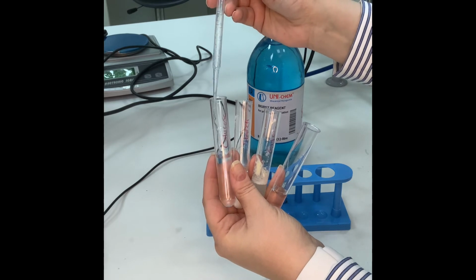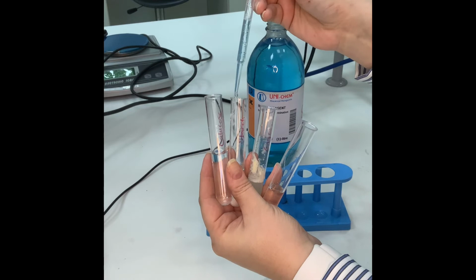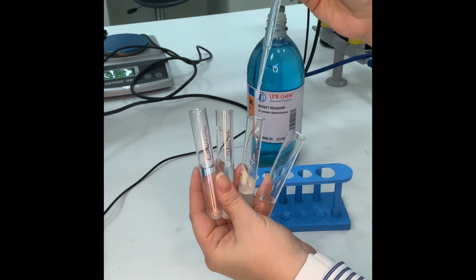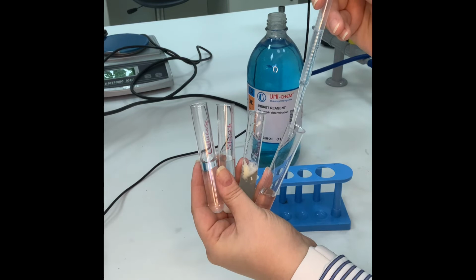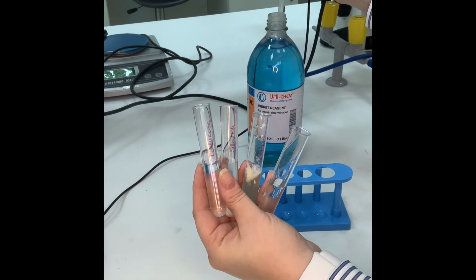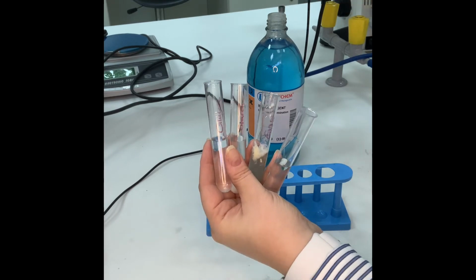to the glucose, to the starch, to the egg white, to the water, just a second.